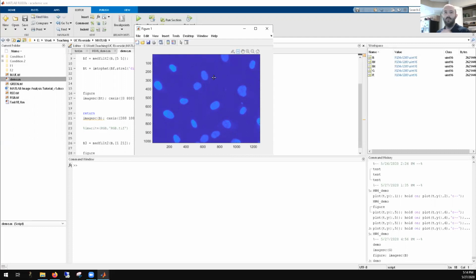And there's some more elegant ways to do this. There's some better ways to do this, some more automated ways to do it as well. And we're going to go through those in future sessions as we start talking about more advanced techniques. But for the moment, let's just take a look.